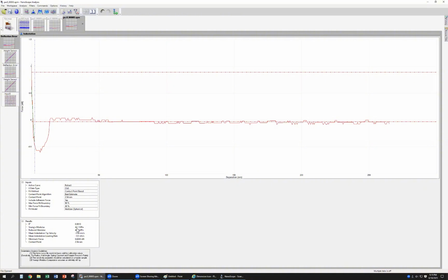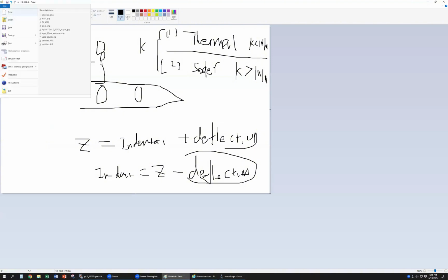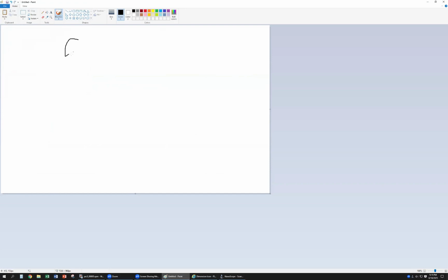So this 1 point is from the first curve you get. You can calibrate your probe later. That's the procedure for the first curve. Collect your first curve. You have two different methods to collect the first curve.